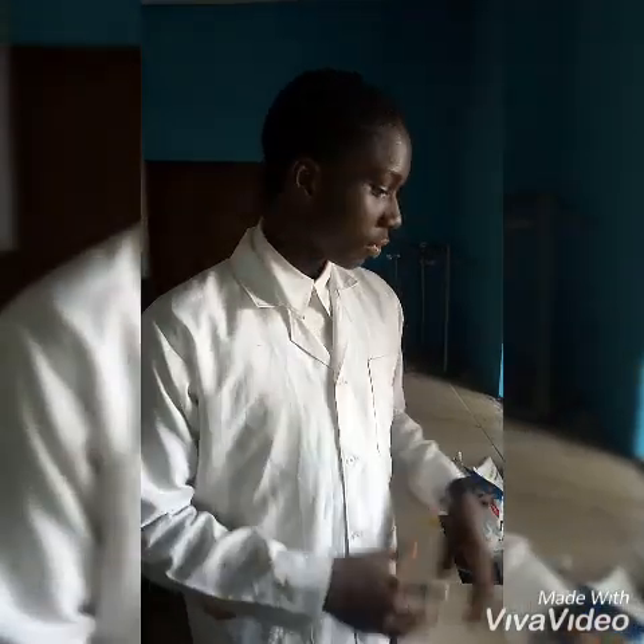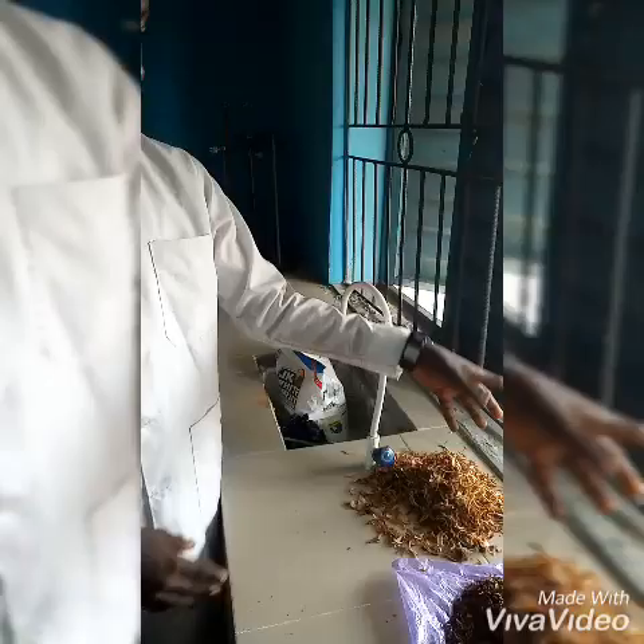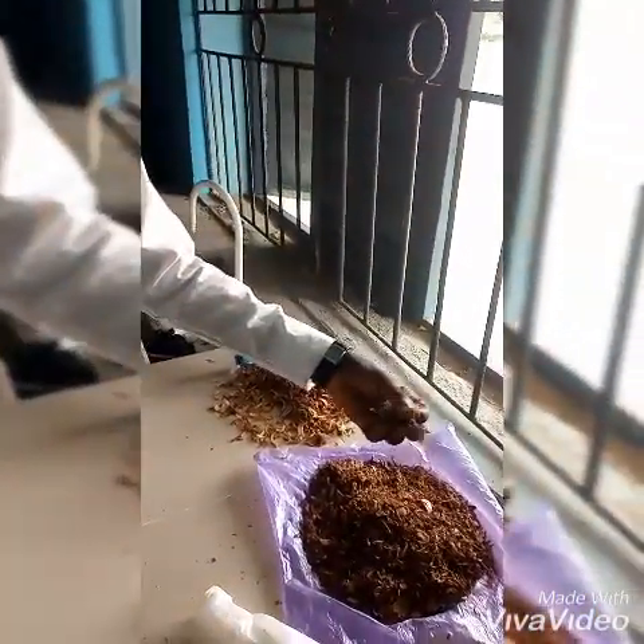Using orange peel, we are about to make activated carbon. We have sun-dried our orange peel — you can see this one is not well dried, but this one is dried. We have dried it for about 10 days.